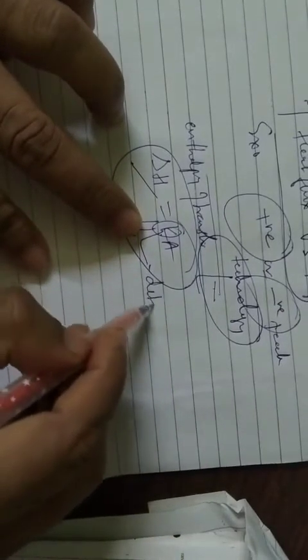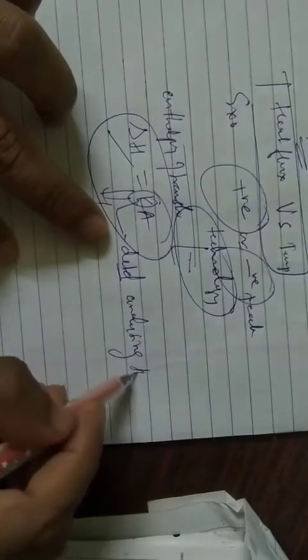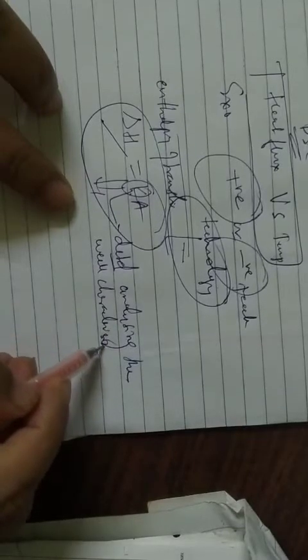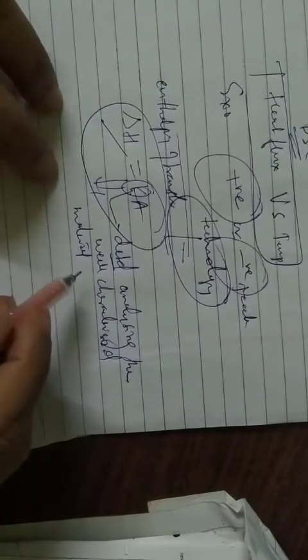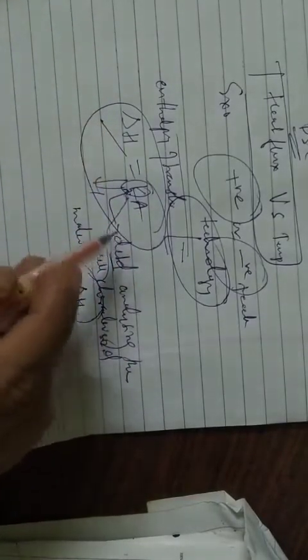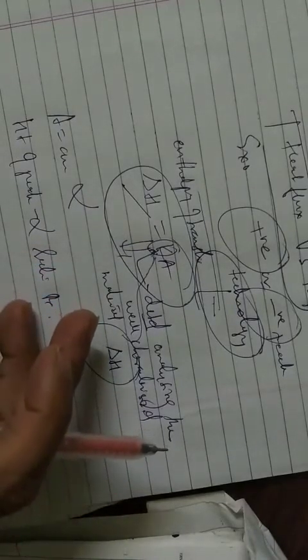It is determined by analyzing a well characterized material of known enthalpy of transition delta H. A is the area under the peak, which is directly proportional to the heat absorbed or evolved in the reaction, and the height of the peak is directly proportional to the rate of reaction, which helps in the study of chemical kinetics.